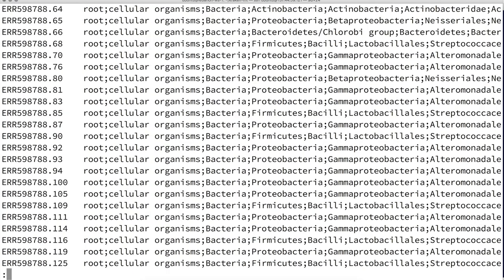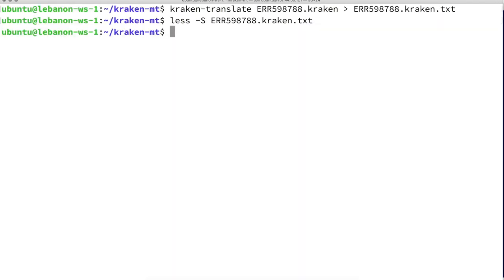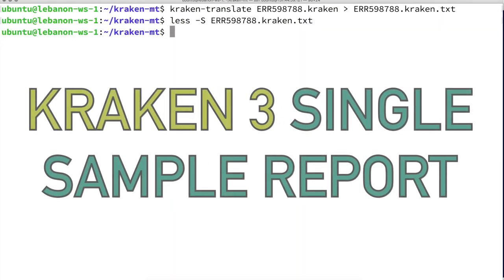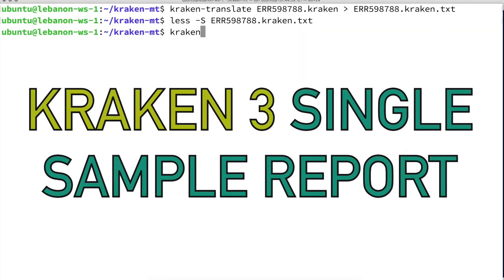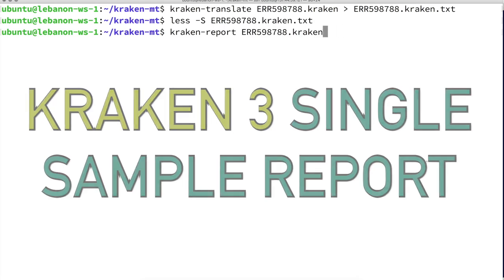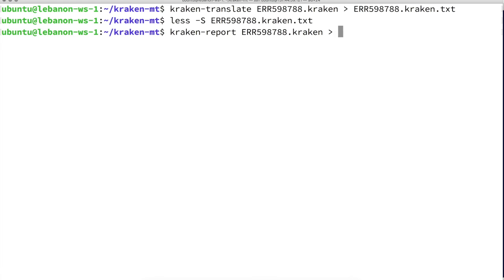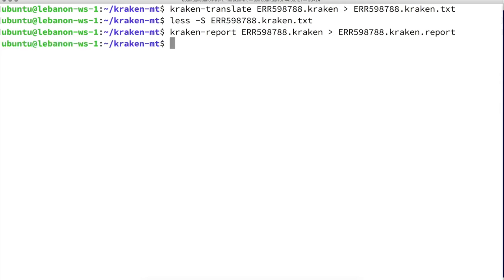At least one read matches the target organism. What we want now is an aggregated report. So we run kraken-report, providing the same raw Kraken output as input. We use an arbitrary name to differentiate the output files.